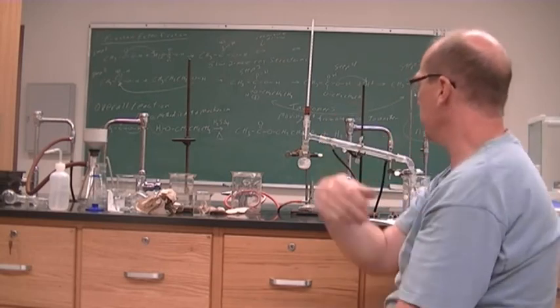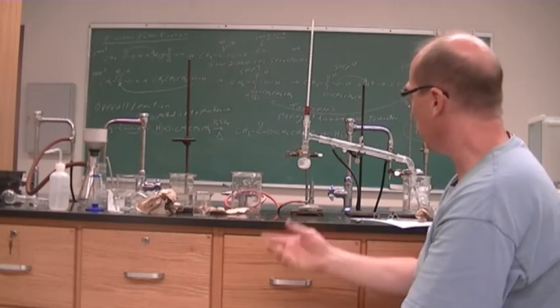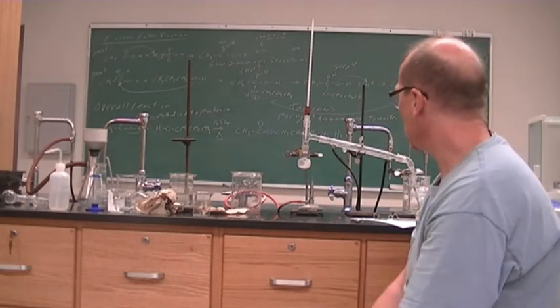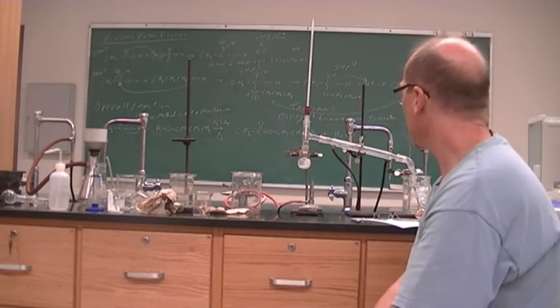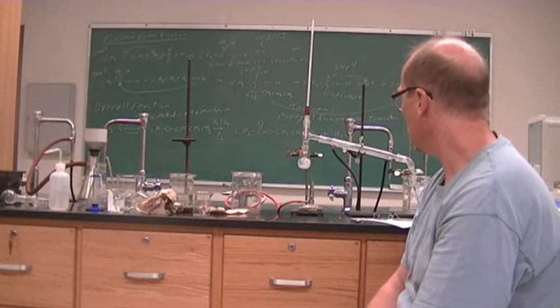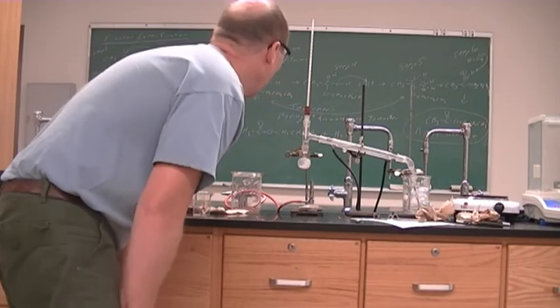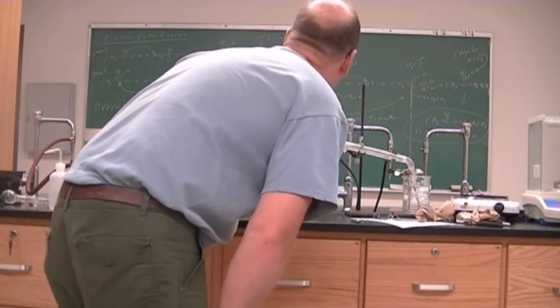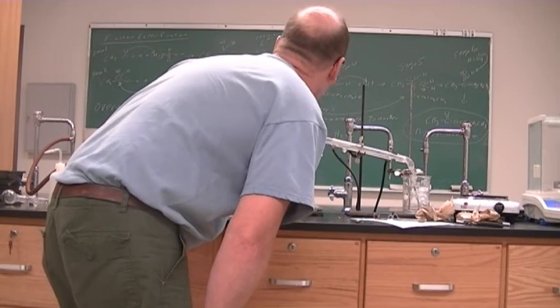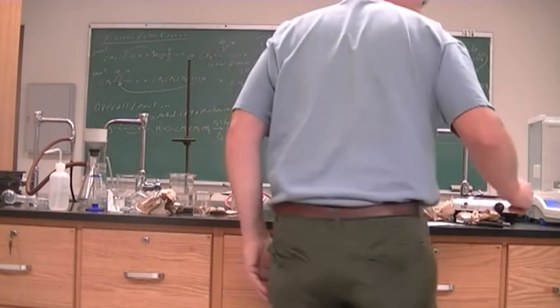All right, so this distillation is going to have to go a lot slower, since we have all the solid in there. We want to get all the liquid to come over. We want the solid to remain in this side. And so I'm doing a little indirect heating, hoping to get less bumping and just boiling up the liquid. So we've got some product coming across, and our boiling point is at 88 degrees Celsius.